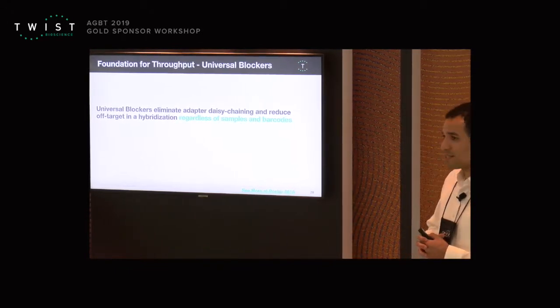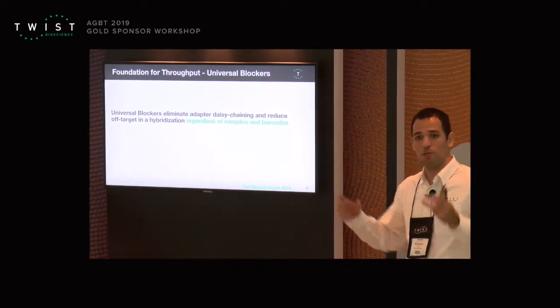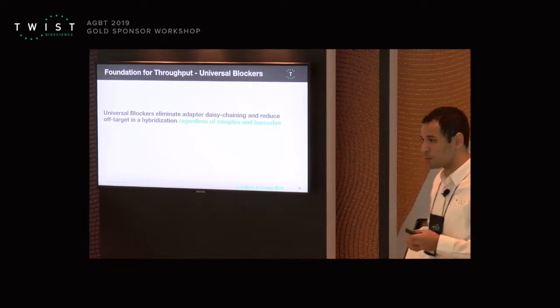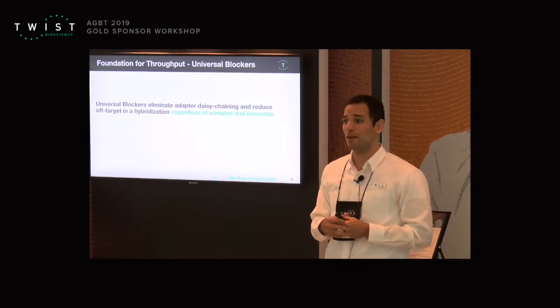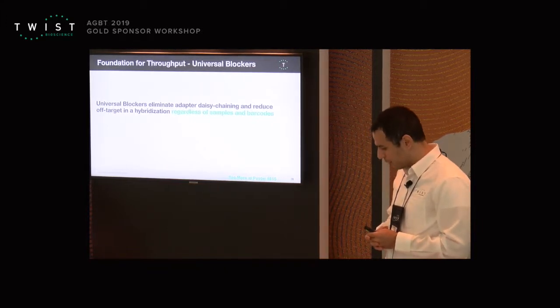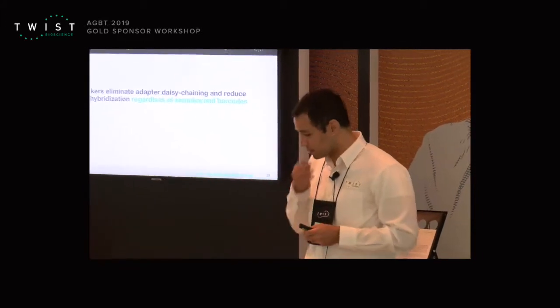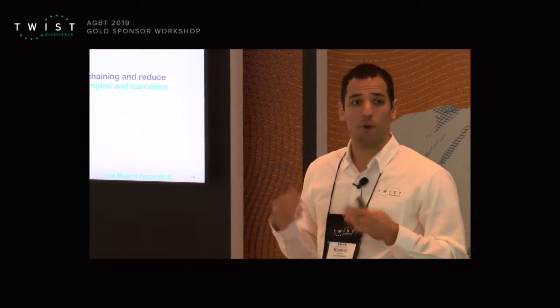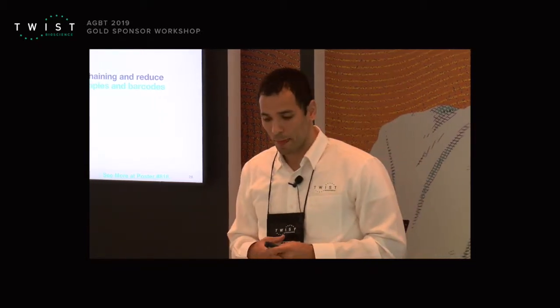But what about multiplexing? You need blockers. Blockers prevent daisy chaining between the P5, P7 primers or whatever system you're working with, and we've developed a really solid universal blocker system that handles that quite well. The importance of the blockers is that they have to be compatible with your barcodes and indices, the ones I was talking about earlier.